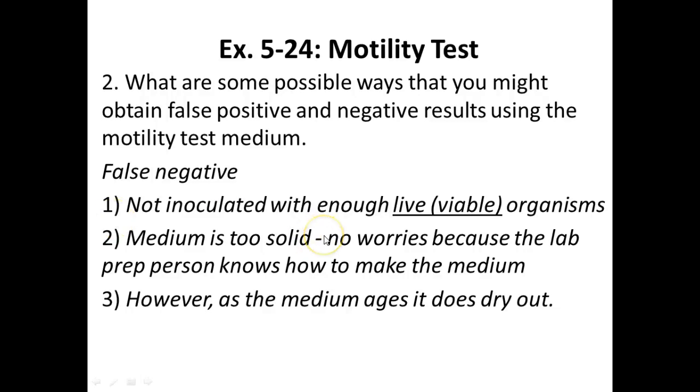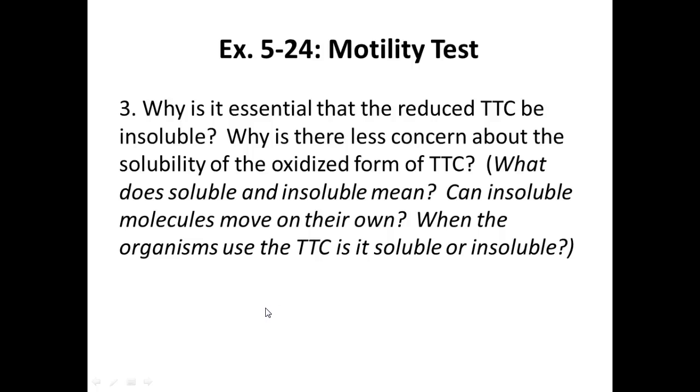The media might be too solid, no worries. The prep person does know how to make the media, though we are having a little bit of difficulty with it right now. However, as the media ages, it will dry out as well, right? And so that would affect, right, how well they move through the media, right, and some of those pocket problems that we sometimes see.